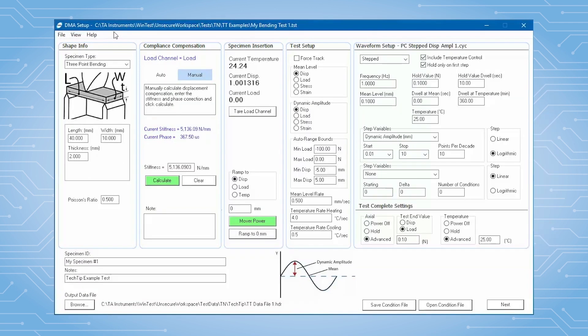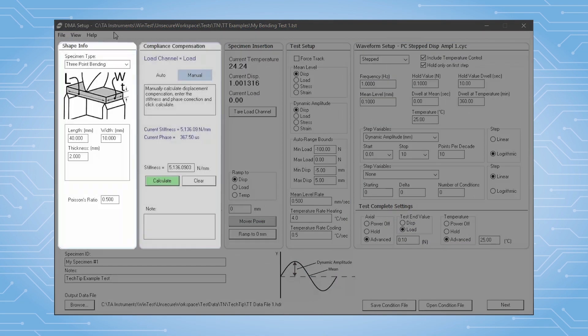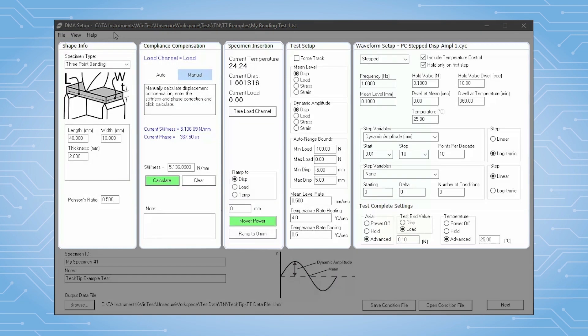The DMA setup window is the primary setup screen for DMA tests. We've arranged this so you will generally progress left to right when configuring a test. I'll walk you through the different sections.